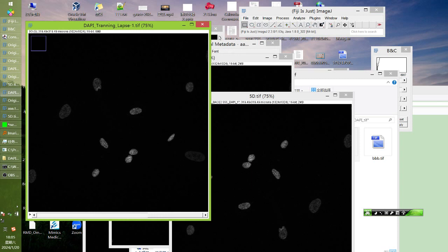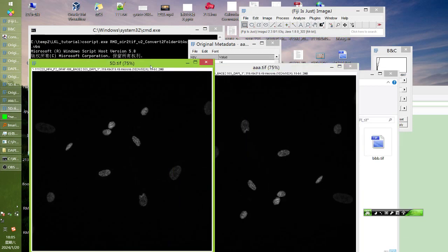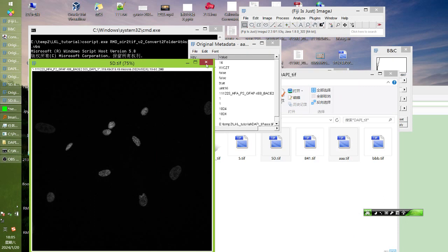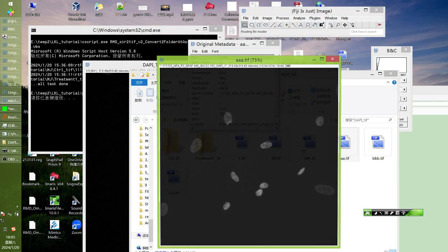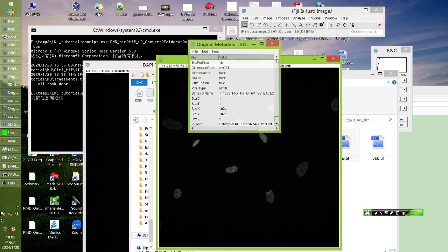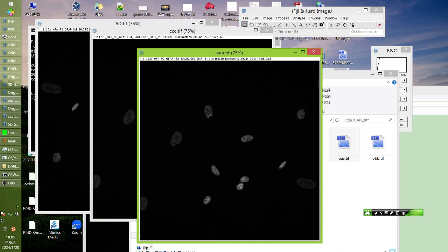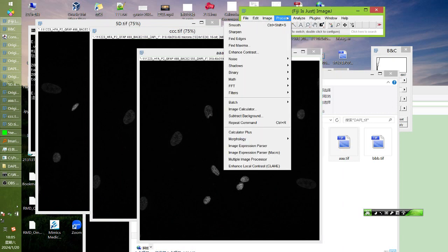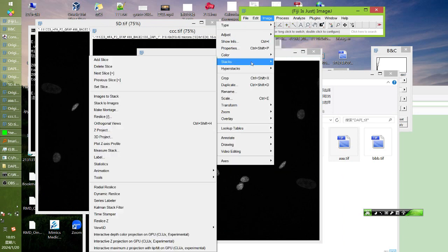First, we need to pick up the second experiment representative images. First, merge them together individually, then merge with the previous stack. Okay. For the second experiment DAPI, we get the 3 representatives, and we do image to stacks.